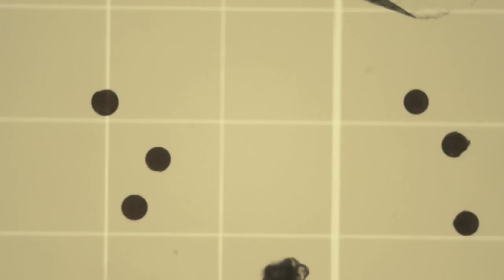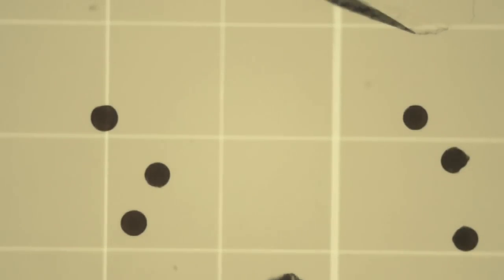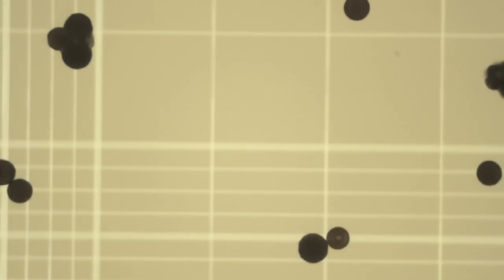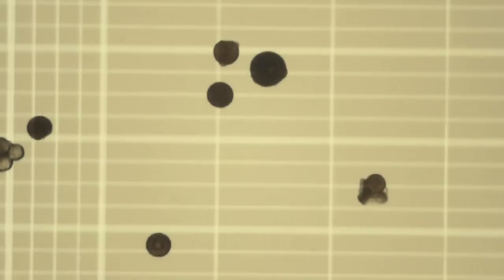So on the second row there's 1 particle, that gives us 2. On the third row there's 2 more particles. The other ones that we see are there outside the counting chamber. So we're at 4. Now that's a hard one to call. It's obviously more than 1 particle, but how many? I'm going to score that as 2 particles. Okay, and so we have 2, 4, and 6 particles in the upper right chamber.